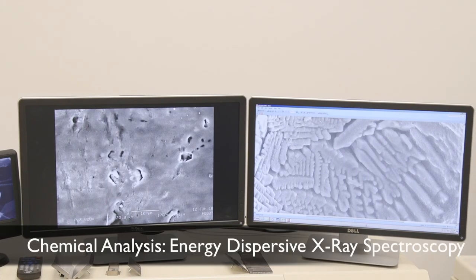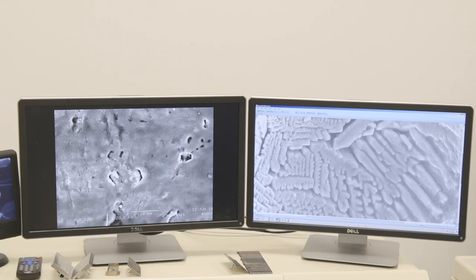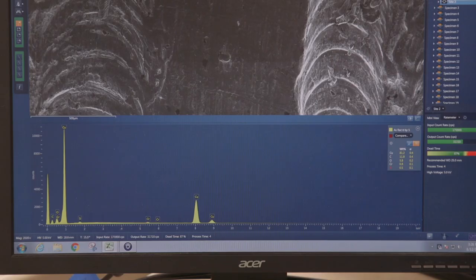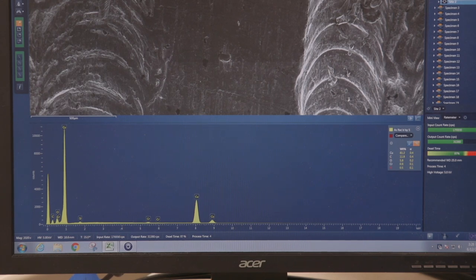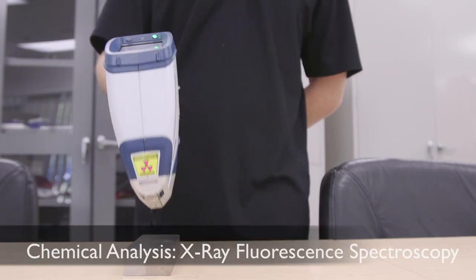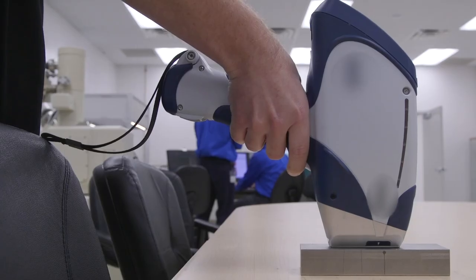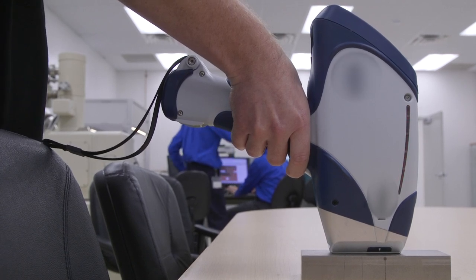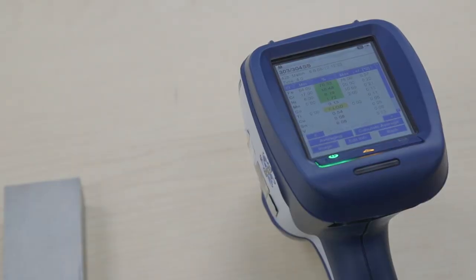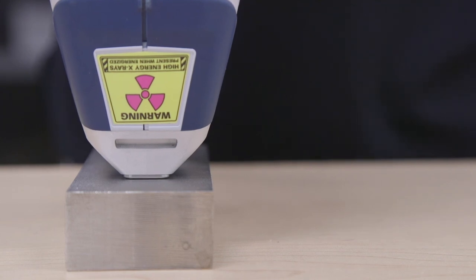This is an example of a coated copper alloy where the coating has been removed by laser ablation. We're using EDS to make sure that the top layer is totally removed and we are down to the bottom metal only. This is an X-ray fluorescence gun — a portable, non-destructive test method used to determine elemental composition of the material. In laser ablation, we're removing a coating from the surface of a material, and we use the XRF to determine whether the layer has been completely removed.